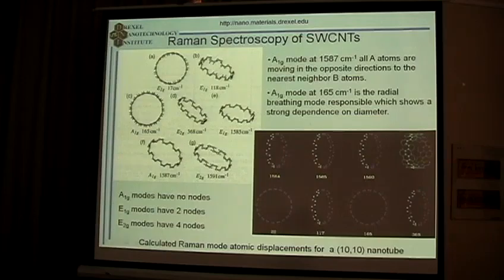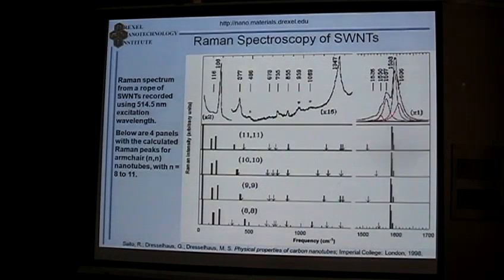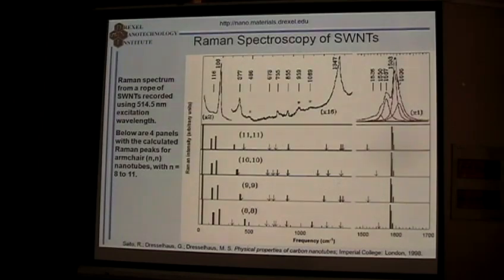As a result, you end up with a much more complex spectrum, which has the graphitic peak of carbon, but now you see it is split into several peaks, and it contains lower wave number modes, which are called radial breathing modes because they result from breathing vibration of carbon nanotubes here. Both are very important. You can calculate those for various nanotubes.